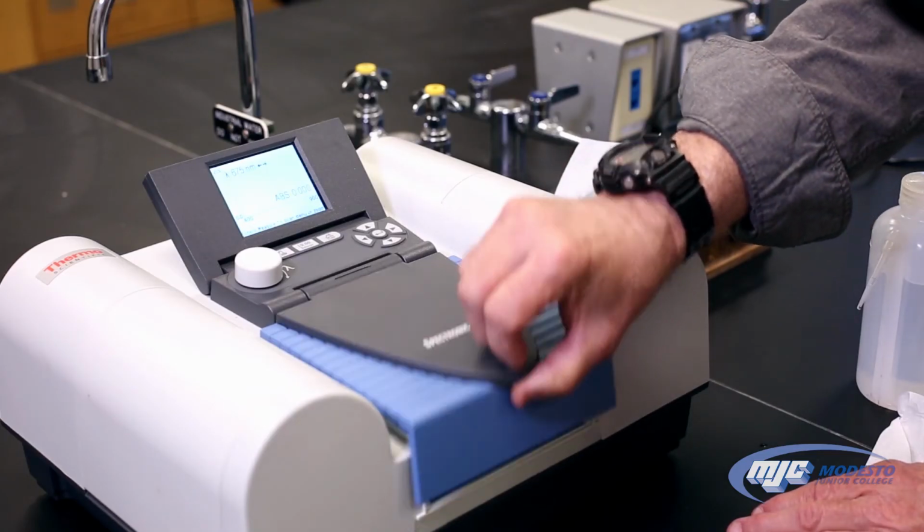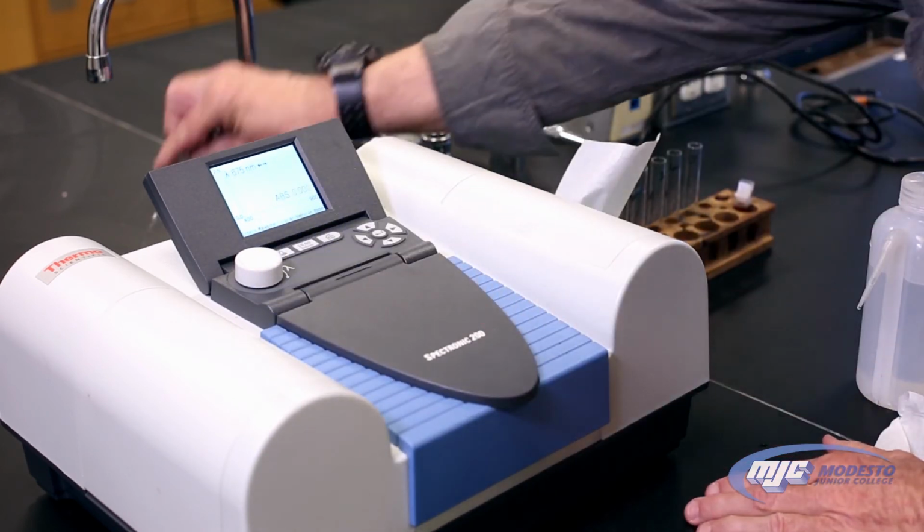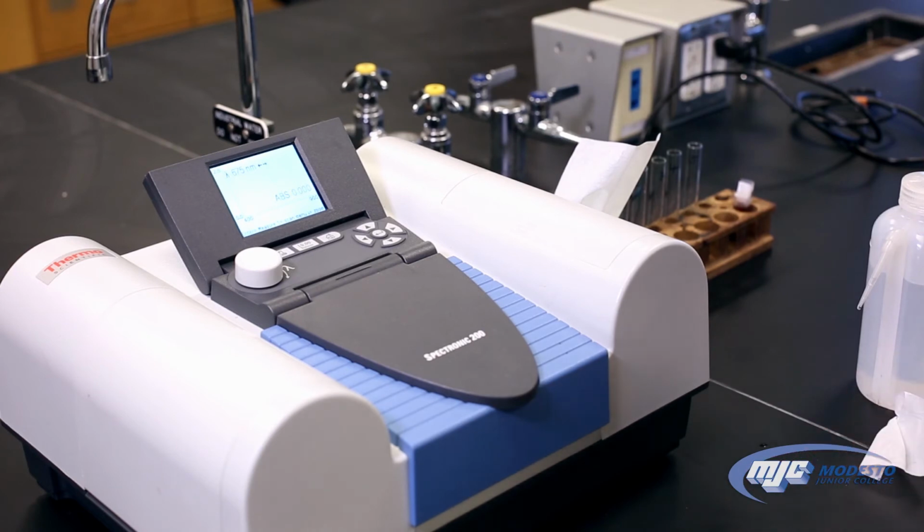So guys, now that it's zeroed, we take this out, dump out the water, and what we're going to do is find the Lambda Max, we're going to use our solution 5. That's the one that does not have any DI water in it. Now, there are some DI water droplets in here. That would dilute the solution, so what we do is we add a little bit of our solution 5 and then dump it out and then fill it up. That way, it won't dilute our solution.